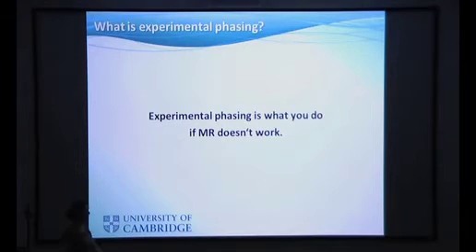Yeah, so I'm going to talk about experimental phasing, Pattersons, and SHELXC this morning. I wandered around my institute and also made some effort on Facebook to find out what experimental phasing actually is. I got a number of answers, but one struck me as possibly the most practical answer you can get: experimental phasing is what you do if MR doesn't work. This surely holds true, but let's go into a little more detail about what experimental phasing really is.